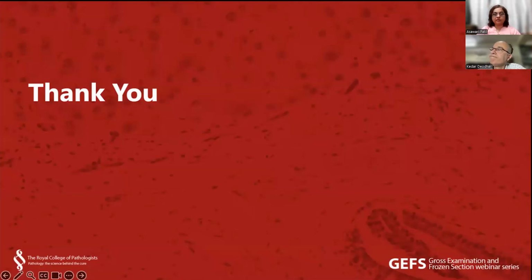I guess the next question is about what is the appropriate time to issue a result? I guess it is about turnaround time. Turnaround time again depends on your institute, and it depends on what kind of specimen it is. Different institutes have different turnaround times, but these are big specimens. So 4 to 5 days minimum are required for the majority of specimens. With decalcification, more time is required.